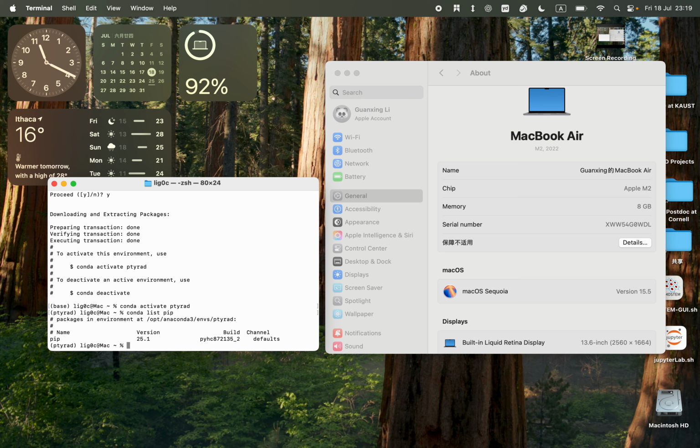Alrighty. And another thing I also noticed is if you happen to have been using pip to install other packages, sometimes it may cache some of the packages, and it could potentially lead to incorrect package dependency solving. So I will actually also suggest people to clean up the cache of your pip. So let's do this: python -m pip cache purge.